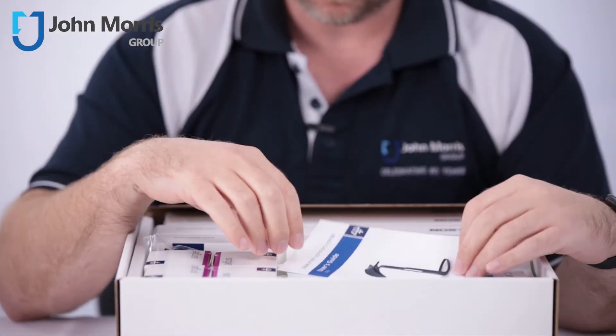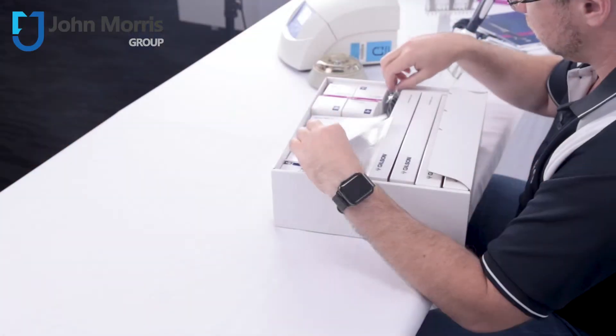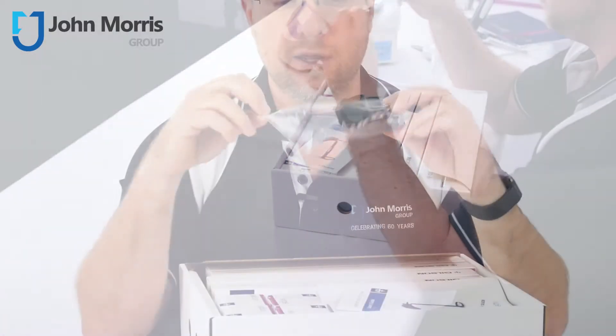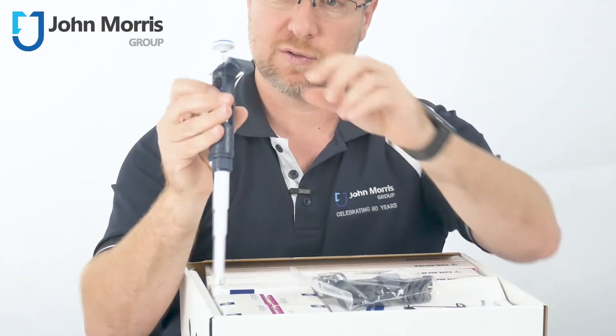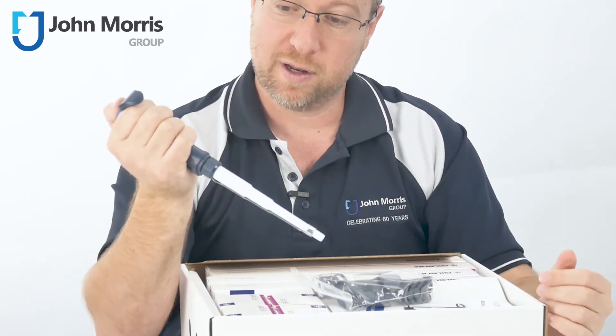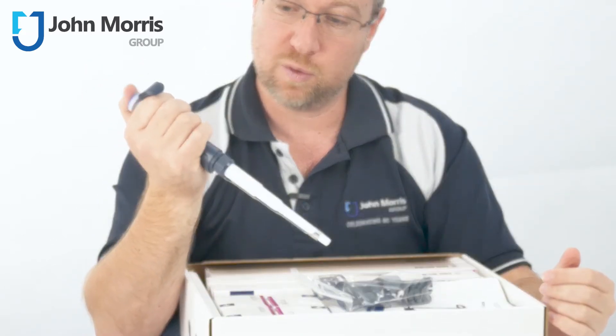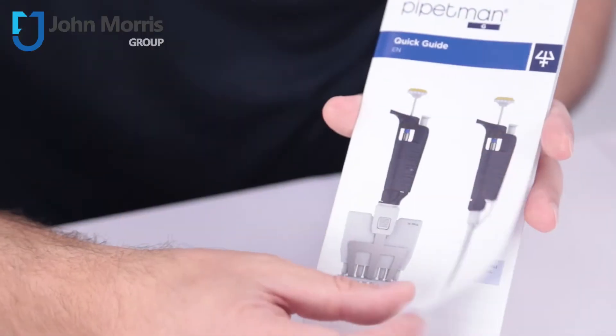You'll find this handy little guide for installing your comfort grips on your Pipetman G's. The comfort grips are located here on the side and they install onto the G just like this — you can see that right here. That makes repetitive or continuous pipetting with your G series pipette much more comfortable — a great little innovation.